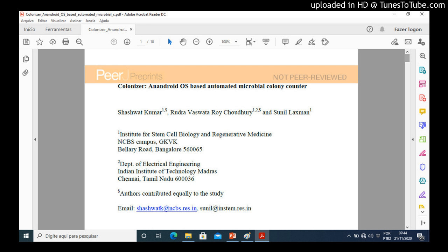Analysis of the data for all three methods described suggests that images with unwanted light reflections or poor quality will reduce accuracy, as shown in Figure 2A and B, when the images are clicked outside the hood under ambient light conditions.